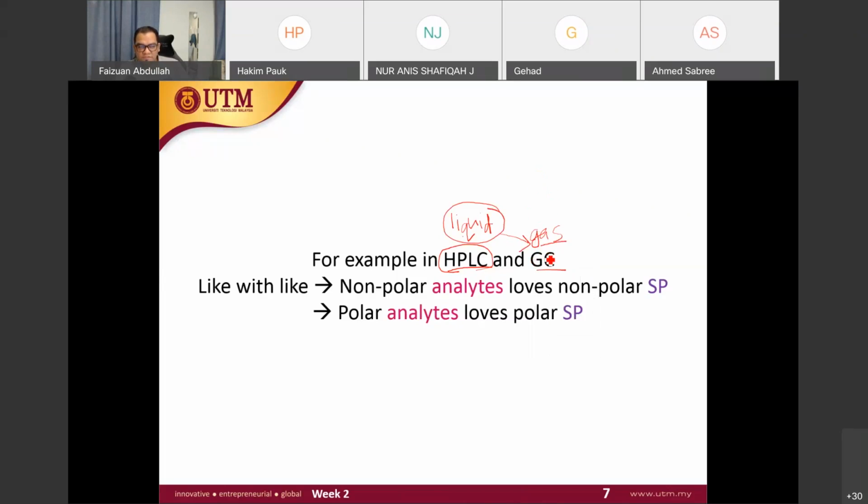And for this instrument, we can also use solid sample. Solid sample that can be transformed into gas. So after being transformed into gas, the instrument will analyze the analyte. Okay, so similar with the spectroscopy method, we have two components of the instrument. So we have two parts.